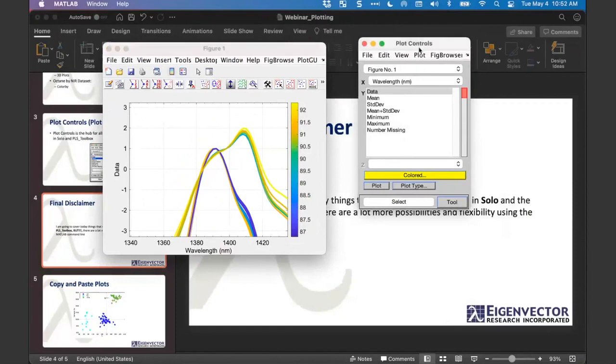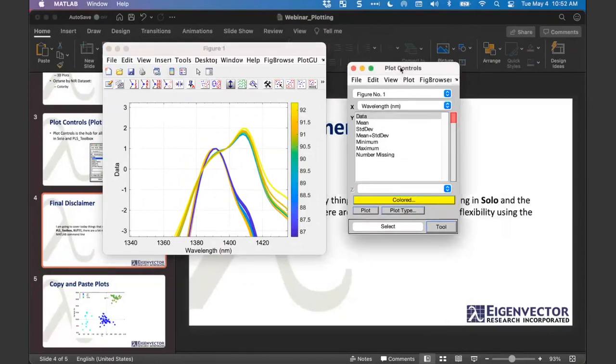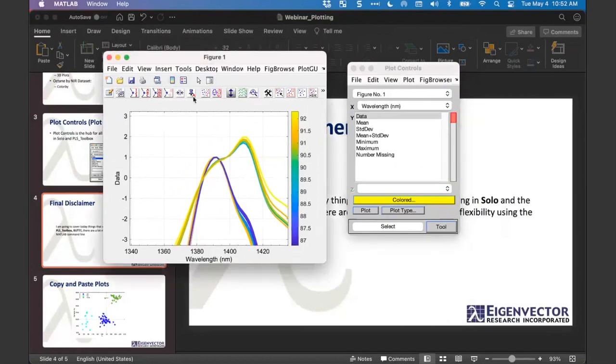And trying to, I don't think unmute that Neil is here. Okay. But yeah, is it insert text? Is that where it is? Oh, there we go, Neil. It's under the insert toolbar up there. Here? At the top, you see the insert menu.